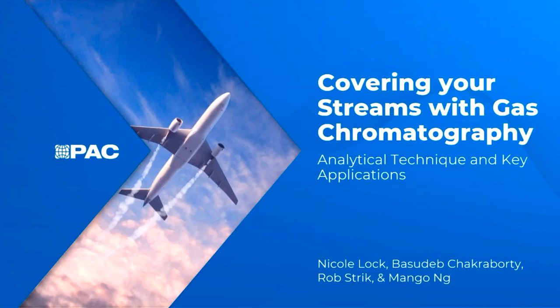Today's webinar will be focused on some key GC applications seen in the lab. We will touch on PAC's rich analytical history, discuss different areas where you might encounter GC, and what to do when your needs fall outside of standard applications.